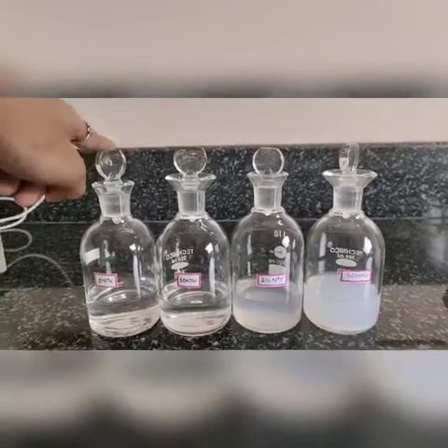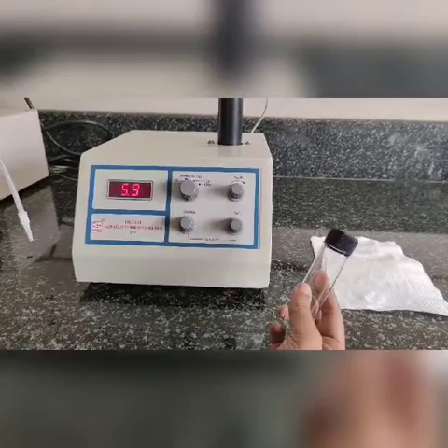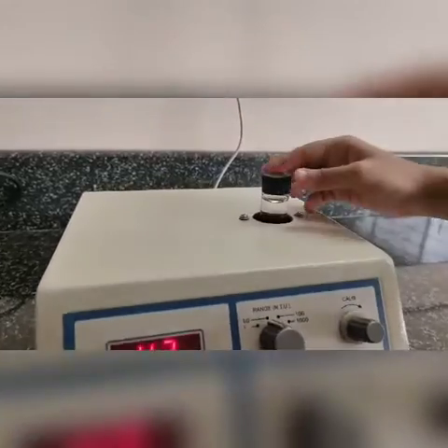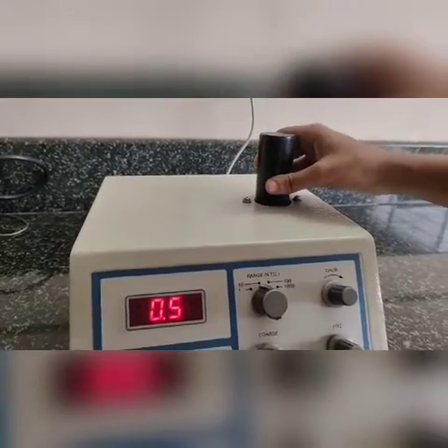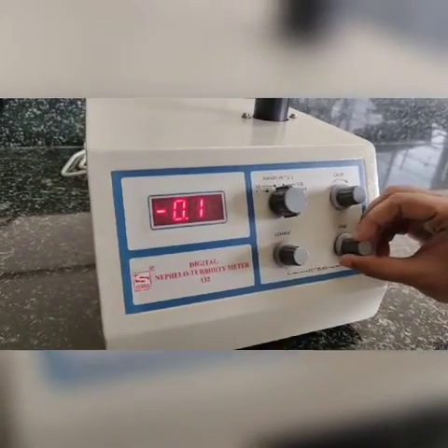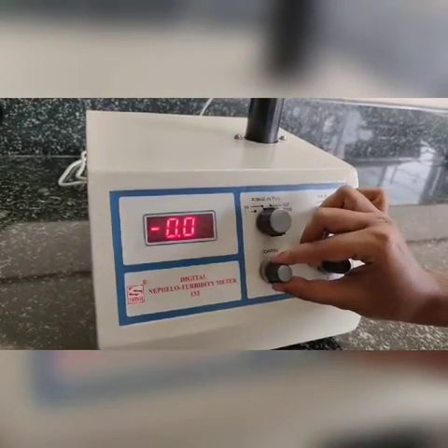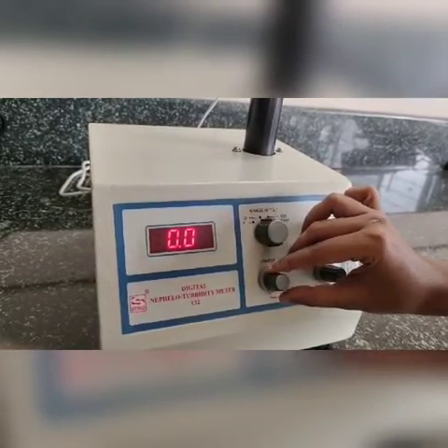Take a test tube and fill it with distilled water. Wipe it with a tissue, then place the test tube in the test tube holder and align it with the line on the device. Close the lid and use the coarse and fine adjusting knobs to set it to zero.